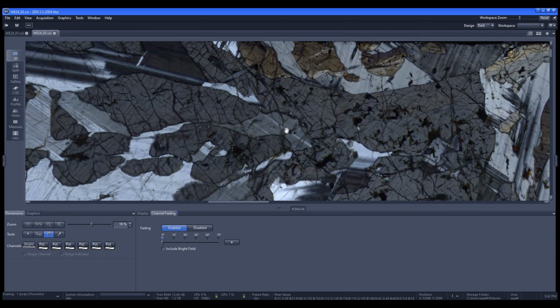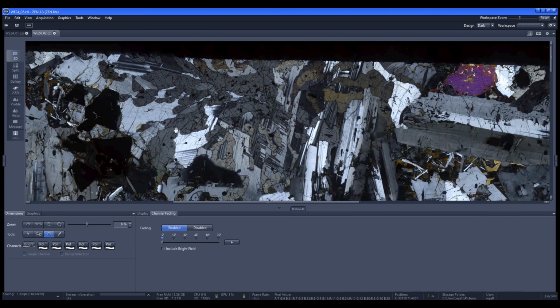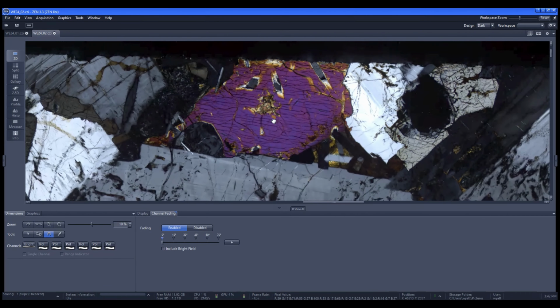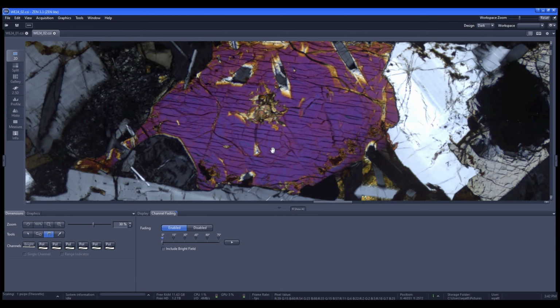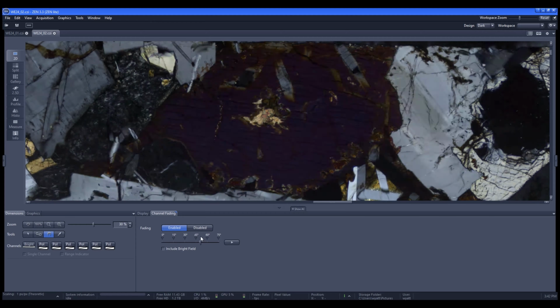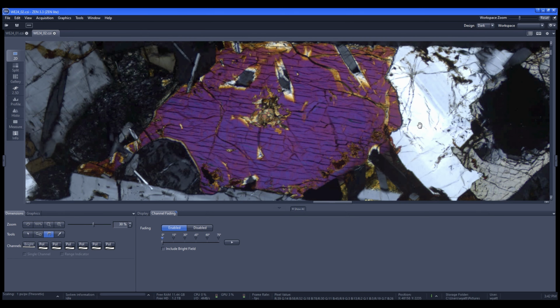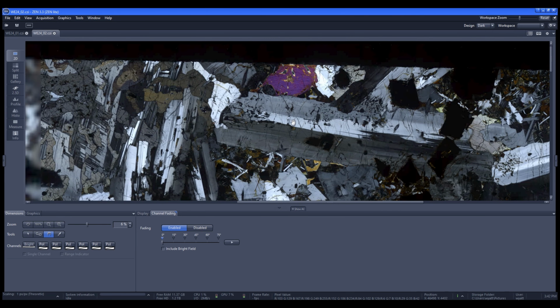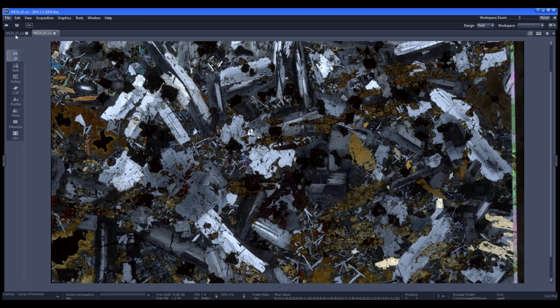You don't see it in any of my basalt samples at all, except this more evolved rock, which is also from Black Butte. And let's look at this nice euhedral pyroxene right here. At least that looks like a pyroxene. The interference colors, it kind of looks like an olivine, doesn't it? But you can see there's some really repeating lines here, so that makes me think that's all cleavage. But maybe it is an olivine, and it's just giving the illusion. But anyways, let's open up another sample here.